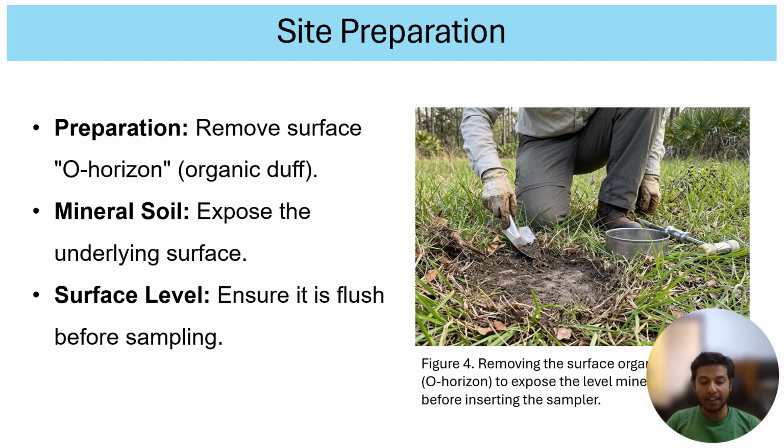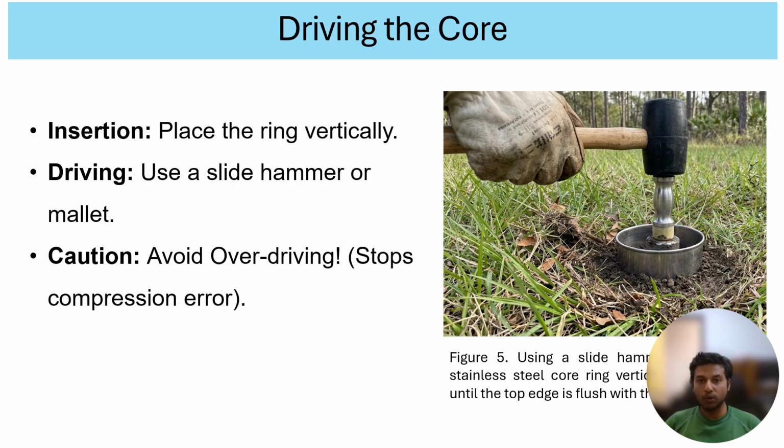Using a hand trowel, we carefully scrape the surface until the true mineral soil is visible, and we ensure the ground is flat and level before proceeding with our measurements. Once the site is prepared, we move forward with driving the core. Step two is driving the core.